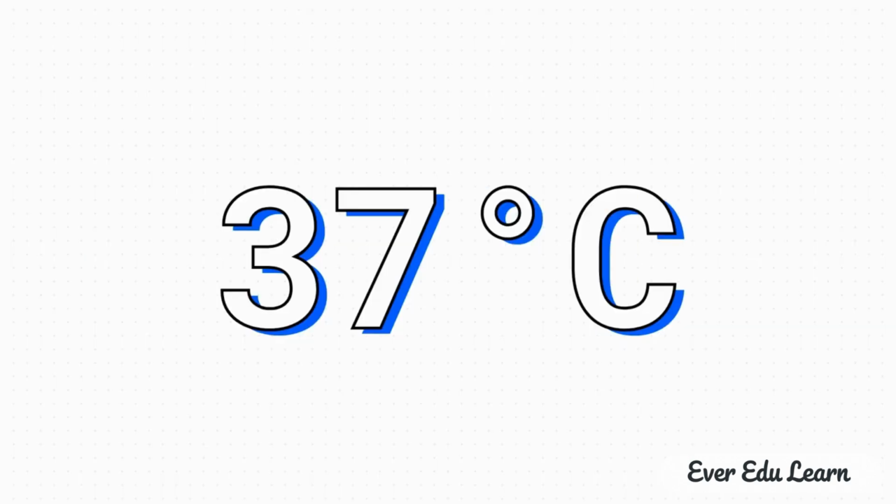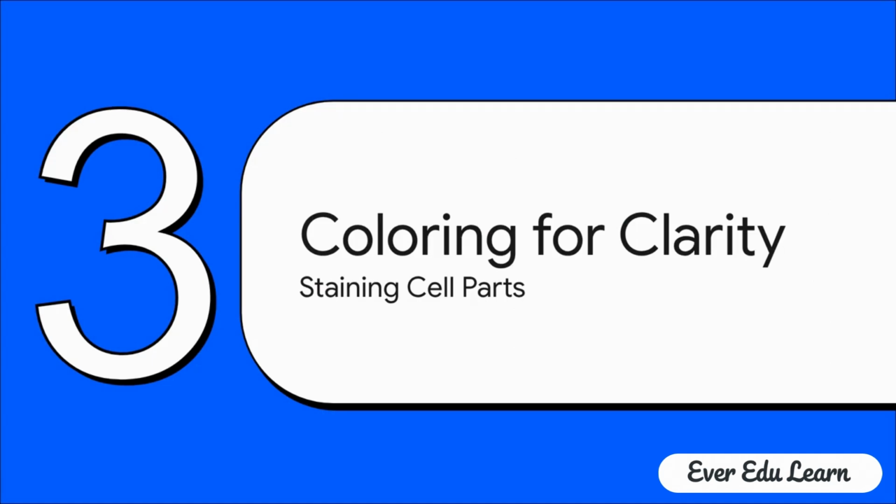And about that incubator, it's set to a very specific, very important number, 37 degrees Celsius. Why? Because that's our body temperature. You're essentially tricking the cells. You're making them think they're still inside a person, creating the perfect, cozy little home for them to grow and divide. So, we can see the cells, we can grow a ton of them.